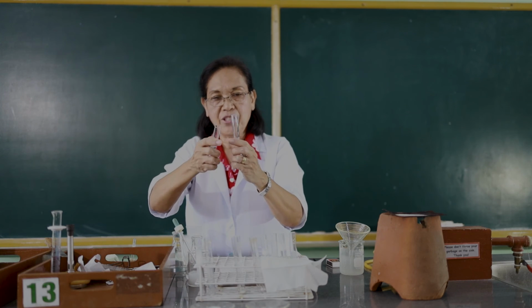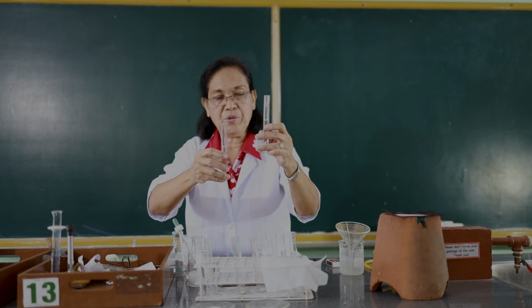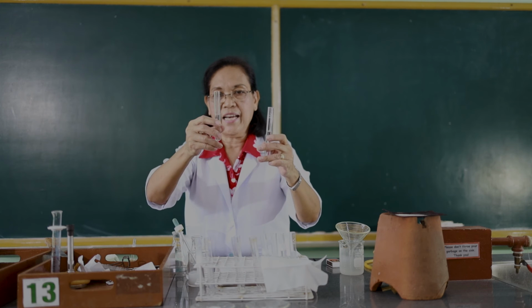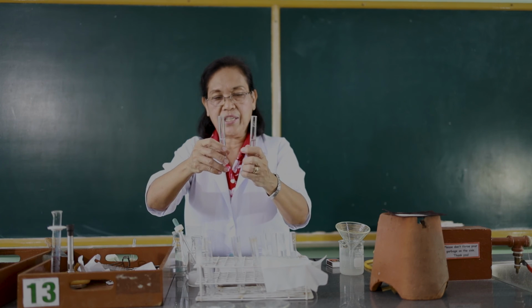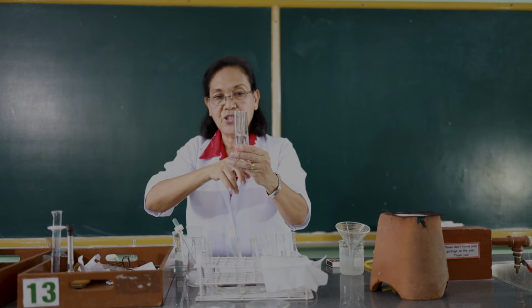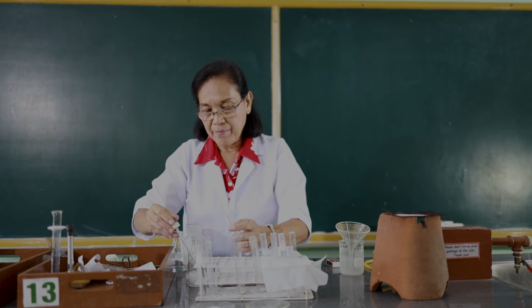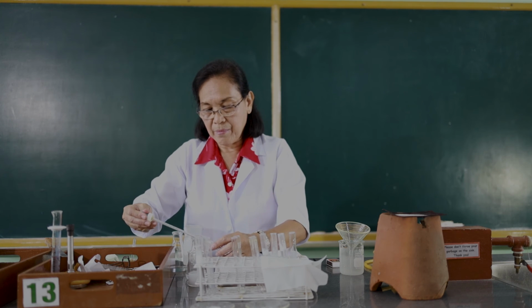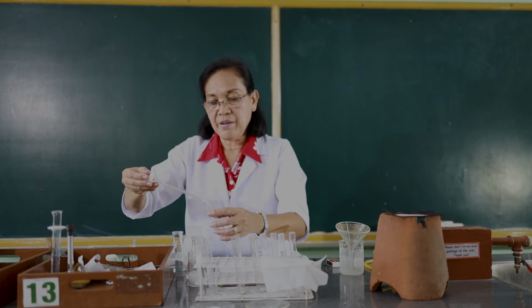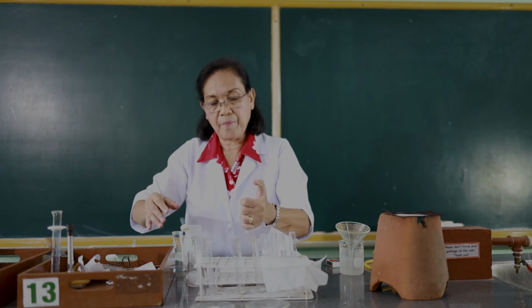Then to these two test tubes, I'm going to add soap solution to one and the other one, the detergent solution. These test tubes contain the calcium chloride solution. Three, four, five, six, seven, eight, nine, ten.